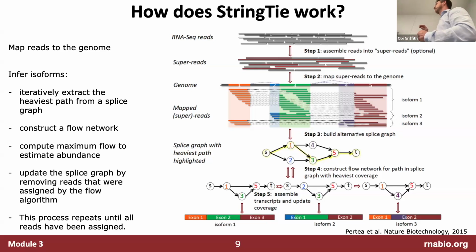So if you're interested in transcript level information, which ultimately we all should be, because there are pretty significant important biological differences between transcripts, right? They can have totally different protein sequences and totally different functions. Some of them are involved in completely different pathways that are regulated under completely different conditions. We should probably all be thinking about transcript level. In reality, 90% of all biology and bioinformatics is still simplified to the gene level, but we should constantly be remembering that that is suboptimal.